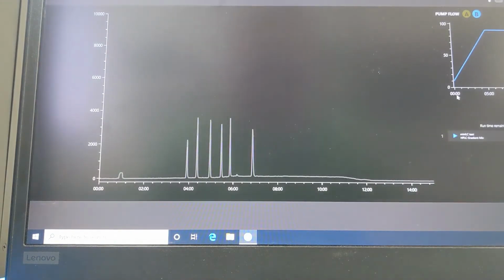And now what we see is our live chromatogram. On this one, we have what's called a reference chromatogram, where you can see in the background, the gray line is a chromatogram that we've run in our lab, and you should get results very similar to this to make sure that your system is running properly. Administrators do have the ability to run the reference chromatogram and designate what sample is the reference chromatogram so that your lab techs know what their chromatogram should look like.